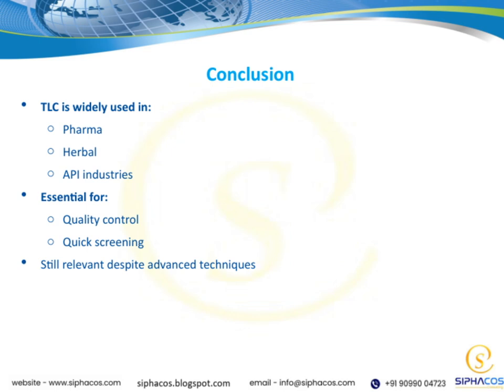It's important to remember that TLC remains essential for quick screening processes, especially when rapid results are needed. Despite the advent of more advanced techniques, TLC still holds a significant place because of its simplicity, cost-effectiveness, and reliability. So, even in today's high-tech analytical environment, TLC continues to be a valuable tool for ensuring quality and safety in many fields.